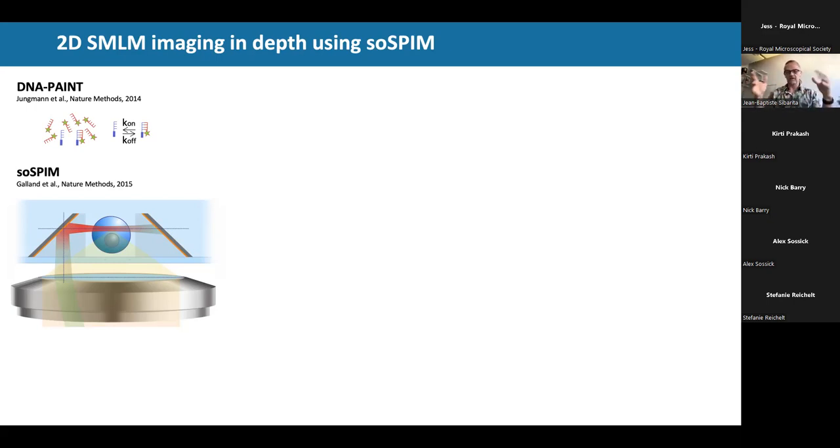So then you can collect for a very long time, because with single molecule there's a big trade-off with time. Time will be, let's say, the limit of the single molecule technique. But now if we're talking about 3D sectioning, then the more sections, the more time. So you need to have access to label. You don't want to struggle with the buffers. Now, if we relate that to STORM, and compared to PALM, we can use organic fluorophores, which are much brighter, then this is where we can get the best accuracy and the best resolution at the end.